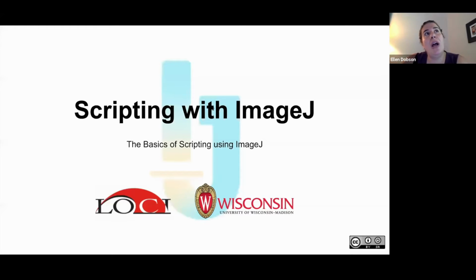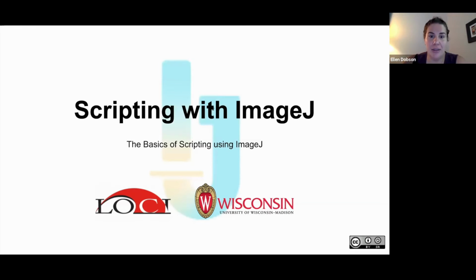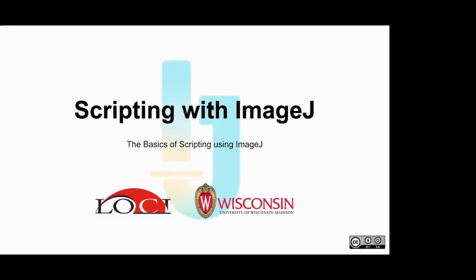But when you say a stack, do you mean you want 3D volumes, or you want to process each slice individually? Yes. What I was asking about was, for instance, you have all of those nuclei in a single slice there, right? If you had that image taken over a Z stack, rather than putting all of them into one plane, could you measure the intensities of DAPI in those nuclei over the stack? Or do you have to compress everything into one plane and then measure the intensity?